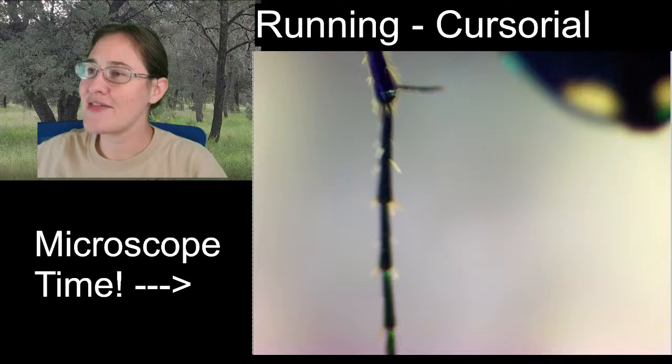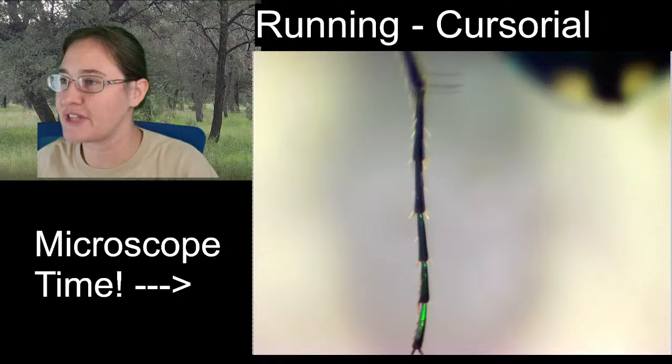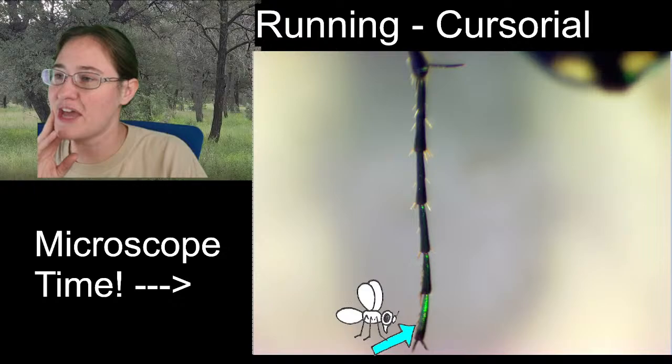And then our tarsal segments. If you get close enough to them and you give them enough light, you will notice that they are also metallic. Oh, look down here. You can see this one's pretty metallic right here. 1, 2, 3, 4, 5 tarsal segments, and then those two tarsal claws.